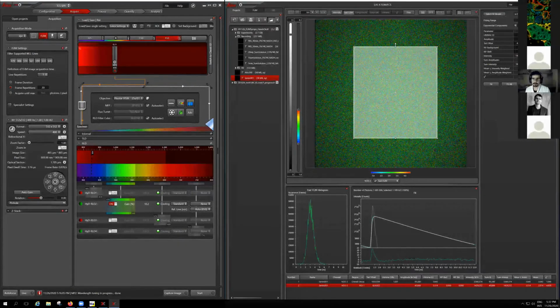I prepared the stock solution days ago, so there might be something wrong with the solution that I use. That's why I see weird behavior in the short lifetime. Also, there might be the chance that some components change.